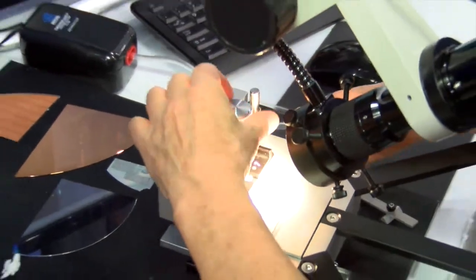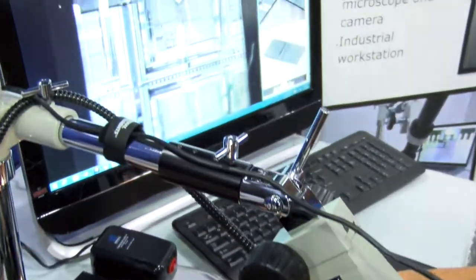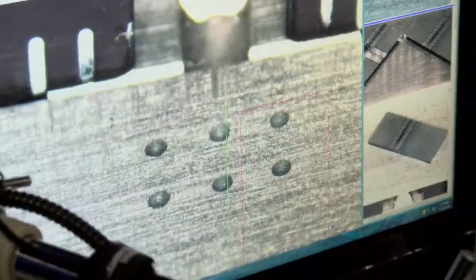The user aligns the tip of the diamond with the target line and creates a very shallow line indentation which is on a micron level. It is 10 micron wide and a couple of micron deep.